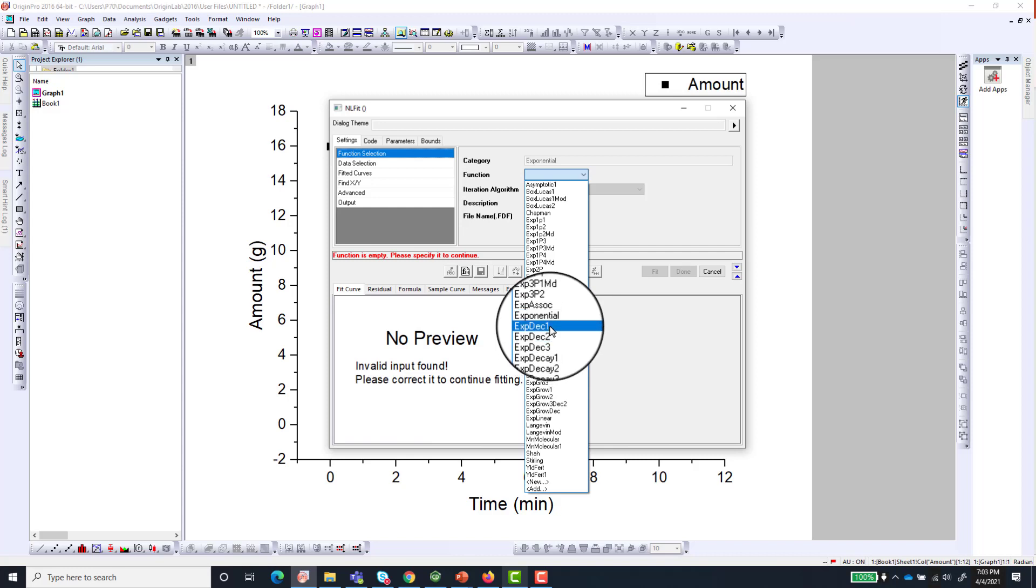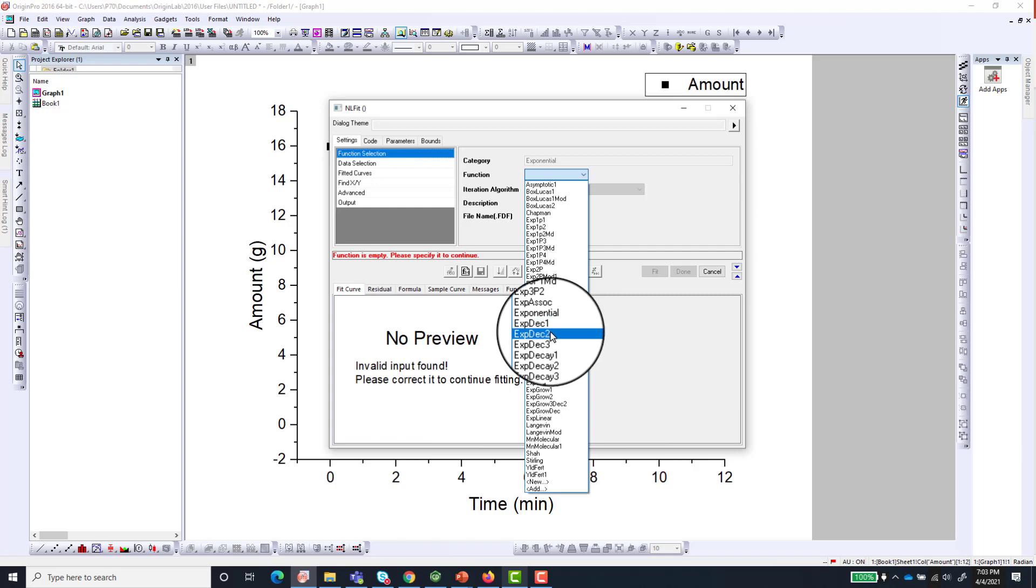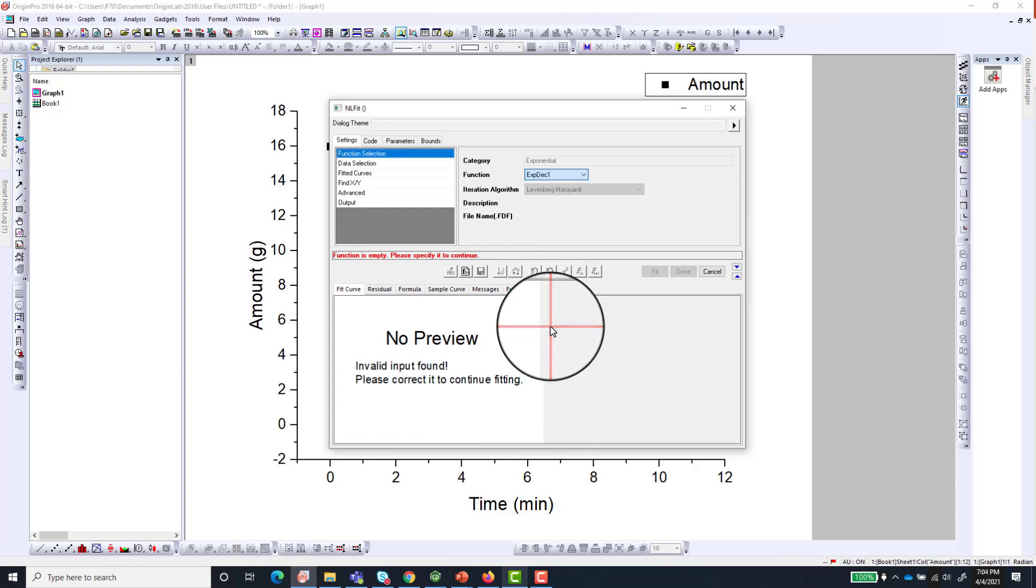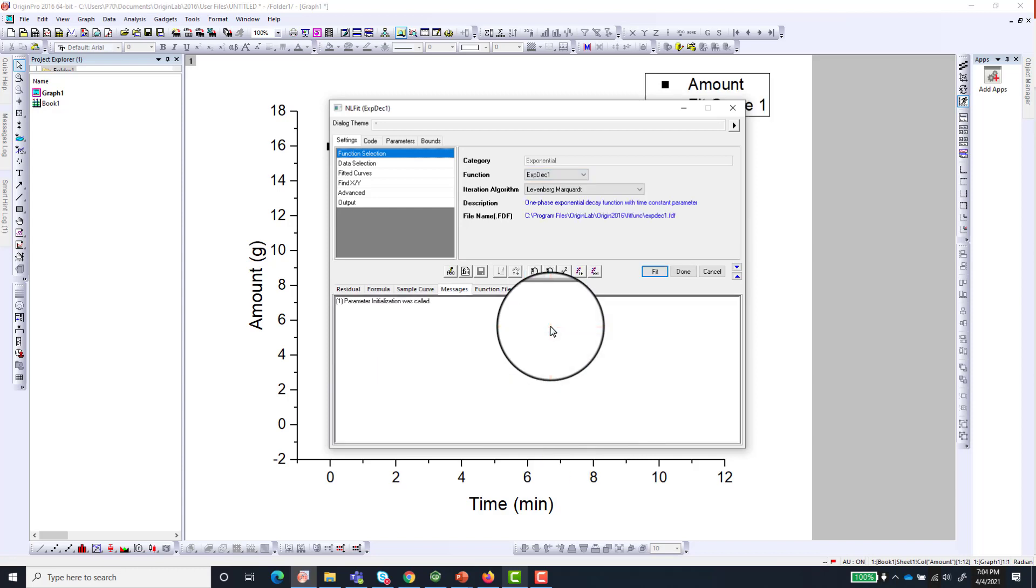ExpDec1 means you just have one decay process going on. I will first try with this and if it fits well then I don't need to try ExpDec2 or ExpDec3. So the easiest one is just to choose the Decay 1.